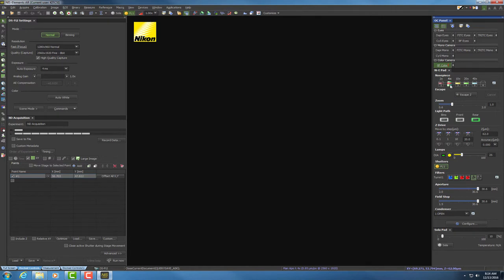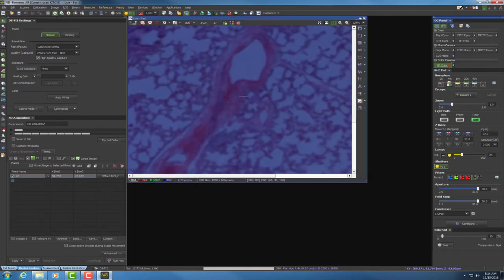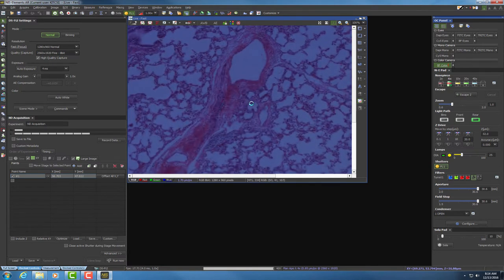We're going to go to the upper left-hand portion of the screen and click on the play icon. That's going to bring up our image — it will always come out not in focus at first. To focus, hover your mouse over the image and scroll up and down with the scroll wheel. Down here, the software is indicating our current exposure value.